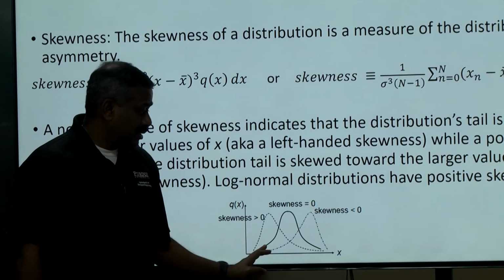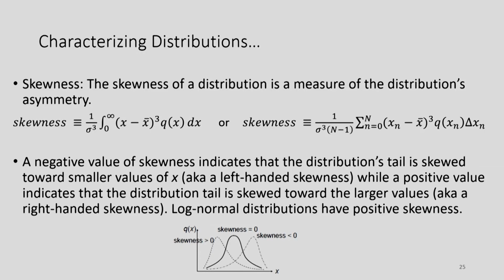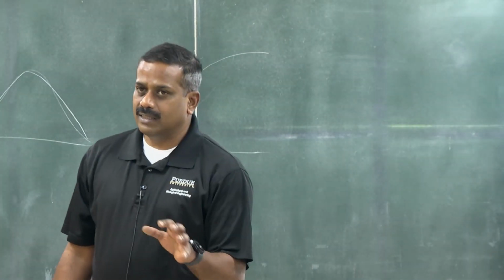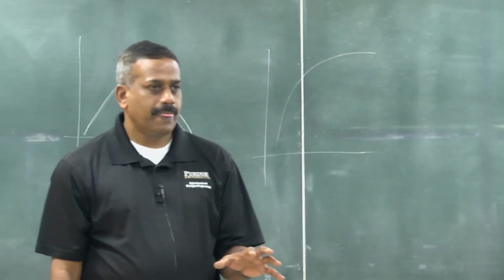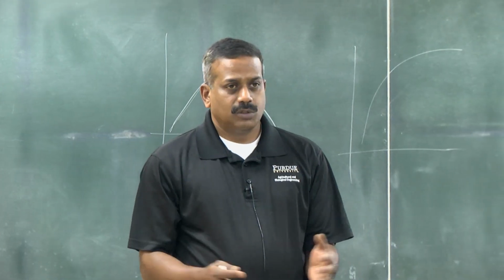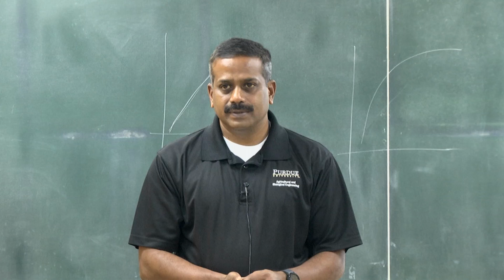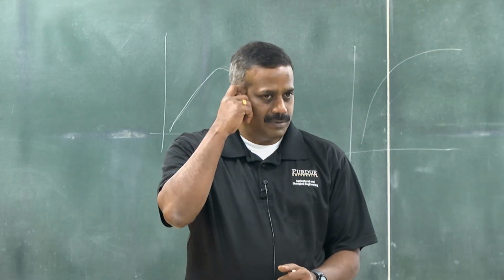If the skewness is 0, it's more of a uniform, almost normal distribution, and the particles are almost uniform. If the skewness is negative, there is a higher portion of larger particles. If the skewness is positive, greater than 0, there is a higher proportion of smaller particles in the mix than larger particles.